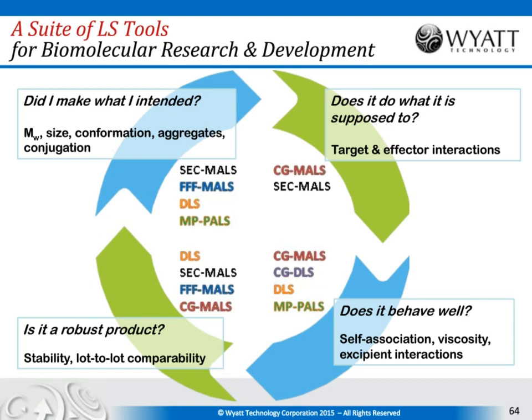What we have is a fluorescence blocking filter that can be inserted into the DLS collection fiber, and that eliminates most of the fluorescence and allows you to make good measurements.